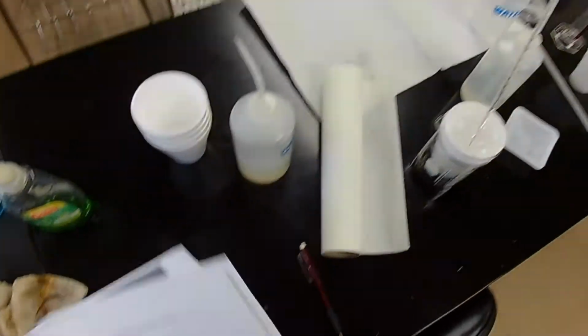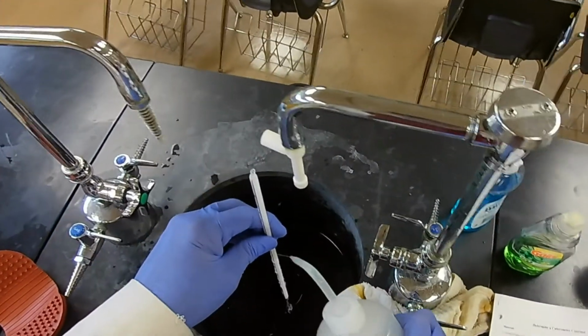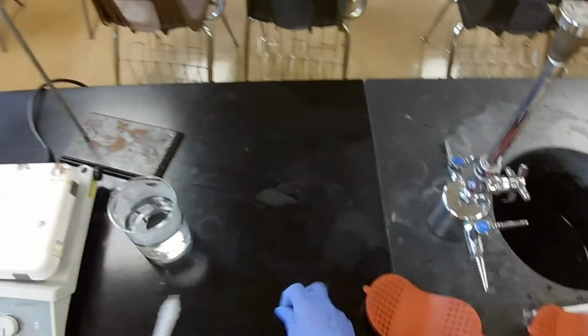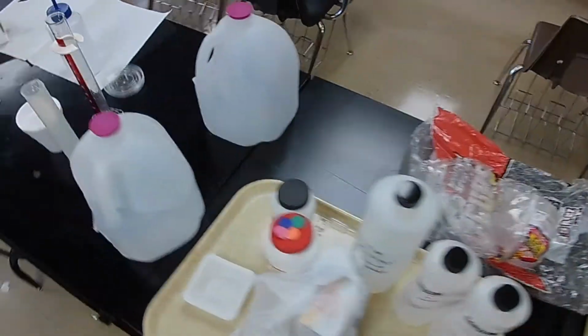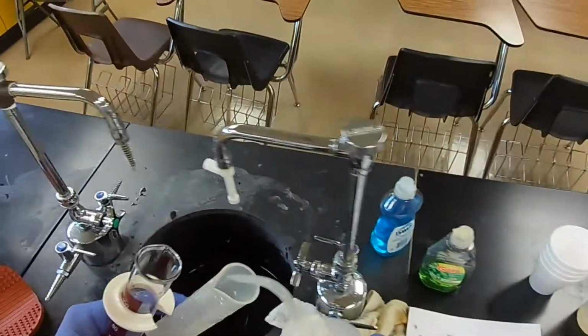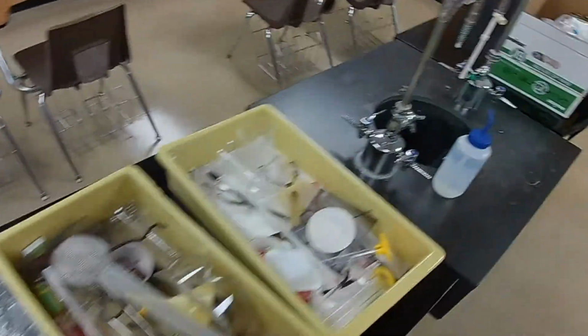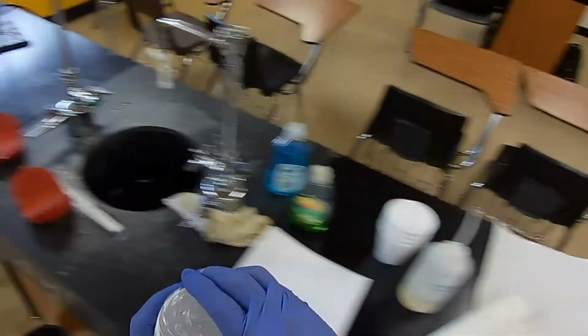Alrighty. Now, let's do a little cleanup before we get into calculations. Put our thermometers away. And let's see, this needs to be rinsed out, I believe. No, we just have water in there. That's still good. And we need to tear down our calorimeter.